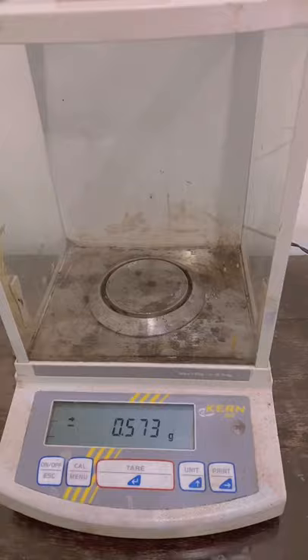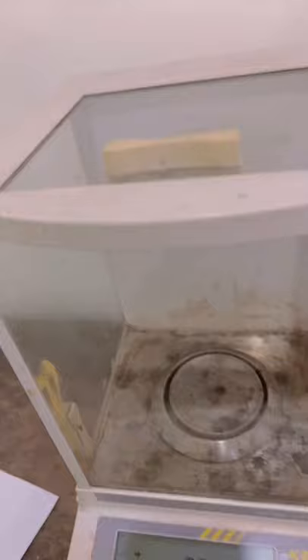I'm here with my analytical balance and I'm going to show you how it works and what it looks like. It looks a little messy because it's been used by a lot of students. This is an analytical balance — you can call it an analytical balance, tare balance, or electronic balance. It is designed to weigh very small, minute samples in the sub-milligram range. It is extremely sensitive — a very sensitive laboratory instrument.